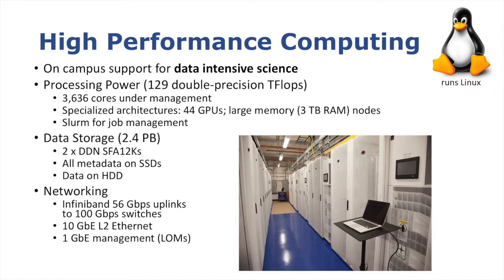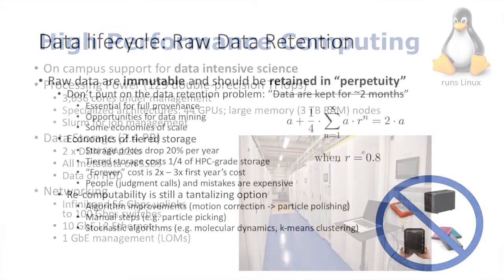So this talk is also just a very quick preview to the tours that we'll give of the data center that many of you have looked at through the window and the CryoEM facility. Essentially, the processing that happens in the CryoEM data after it's collected lands in that infrastructure over there. The vital stats are there. I think this is probably the smallest system that's been presented today. We're a small institution, but it is what we have.